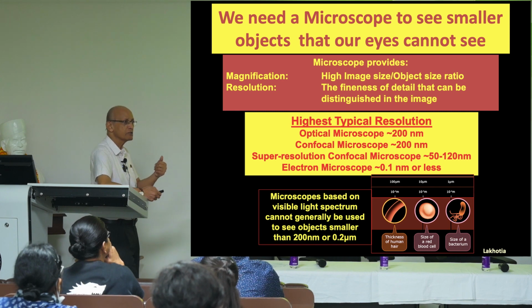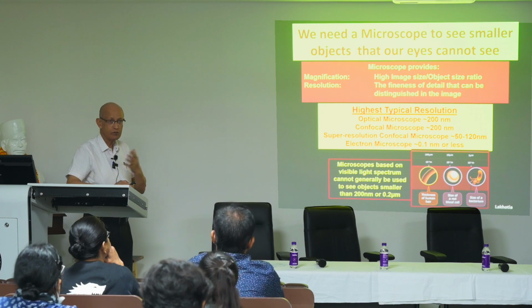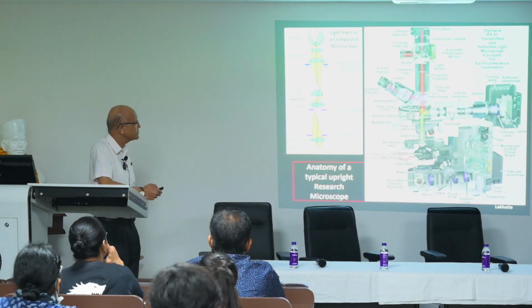In addition to electron microscopy, there are a variety of tunneling microscopes, like the atomic force microscope and so on, which work on different principles. I'll not be going into detail about that.